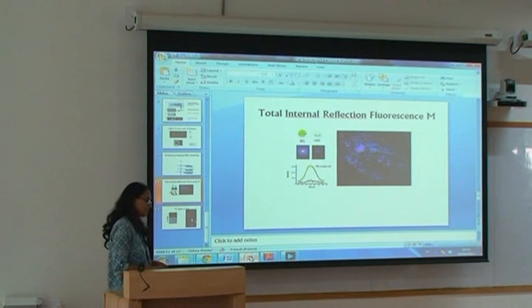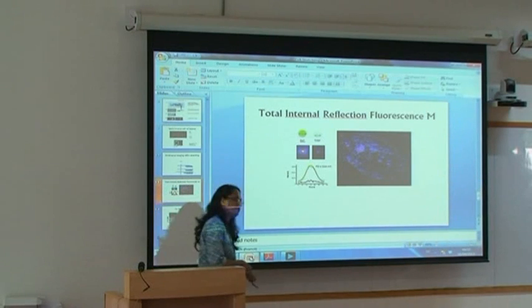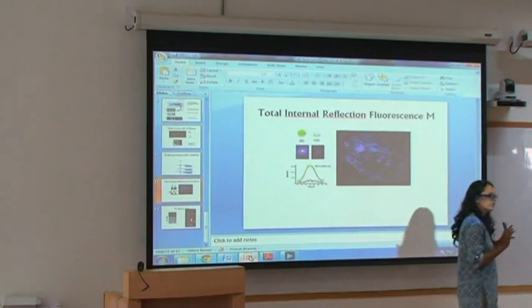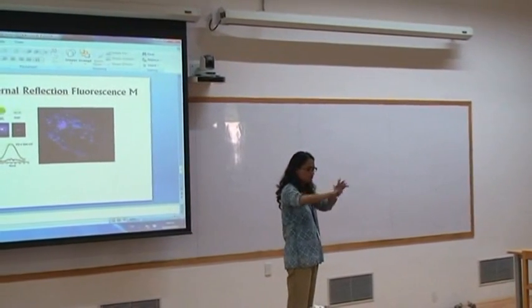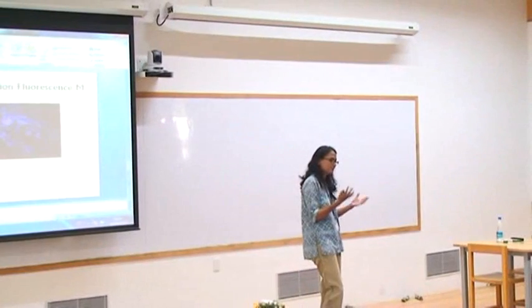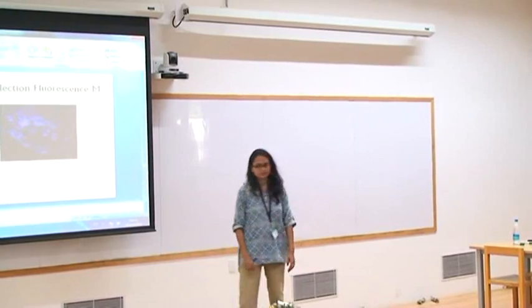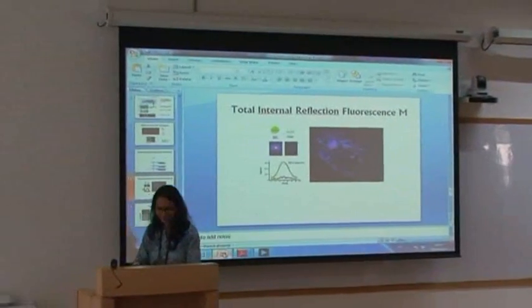Yesterday we had problems with the PDMS not being very flat, so we had an oil problem. If we list the problems, we had more of them, I think. We had the software deciding to forget about the blue filter and just blast the whole spectrum of the lamp on the cells, and we finally lost the fluorescence. So today we are going to do just imaging. We have a lot of samples. So yes, the first day our cells were not growing. The second day the cells grew, and then this happened.